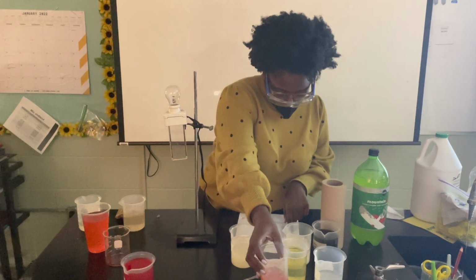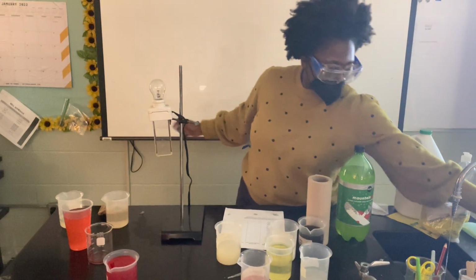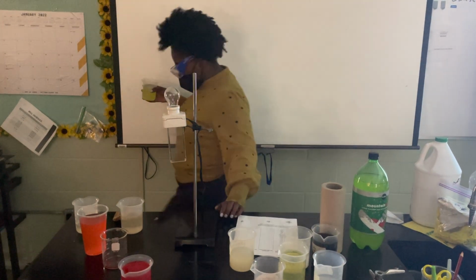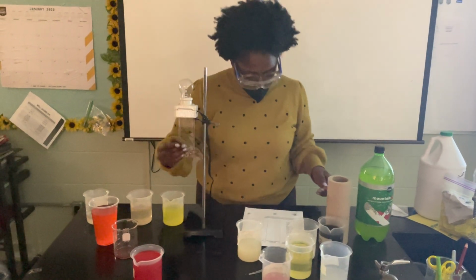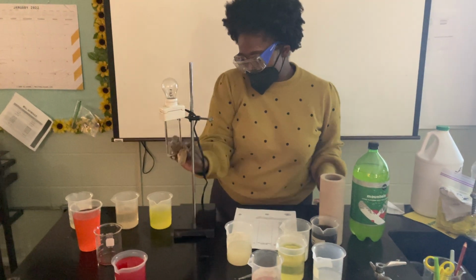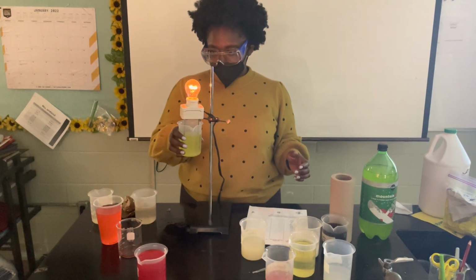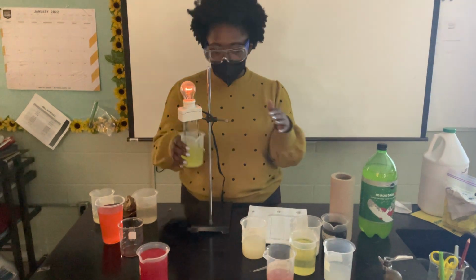Next we have Gatorade. Oh my goodness. Got it. Thank you. Next we have Gatorade. Whew. That ammonia is smelling. Next we have Gatorade. Gatorade has electrolytes in it, so let's see if it lights. We're almost done, kiddos. Ooh, I would give it fair. I would say this is fair.